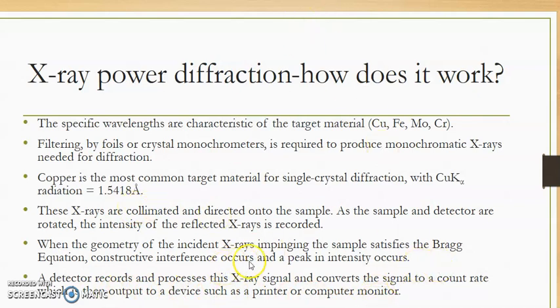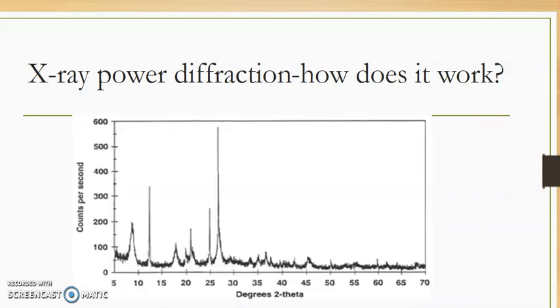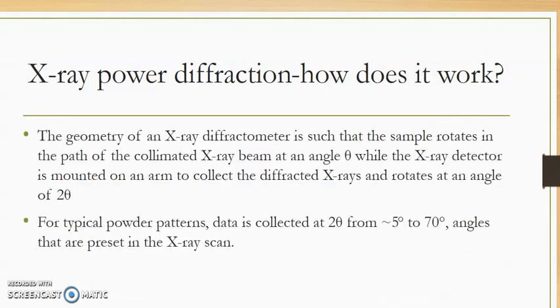That is, it records the maximum peak where the intensity is maximum, and we can print it and see the pattern. Just look through the figure: at some point the intensities are maximum, and here you can see the intensity is maximum.